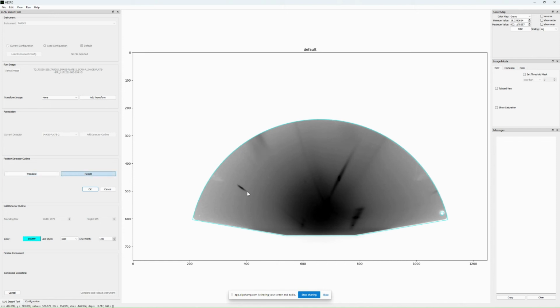The arrow keys work fine. So if I select rotate here and I do arrow key input, you can see that I'm rotating that image plate boundary for doing my cropping. It depends scan to scan. The translations are all over the place within the scanned region and the NIF archives, but the image plates are usually pretty square. I'd say they're all usually within a degree of being square, where this bottom edge is at least parallel to the bottom edge of the scanned region.